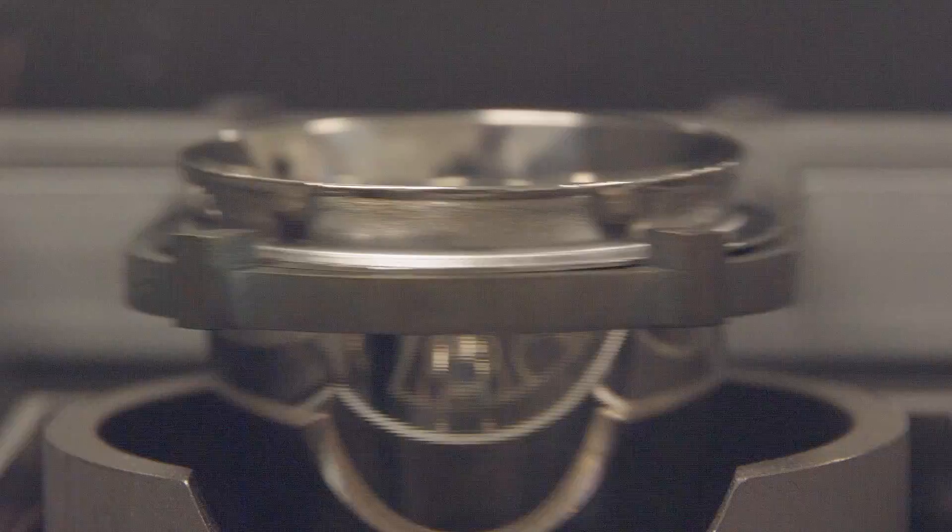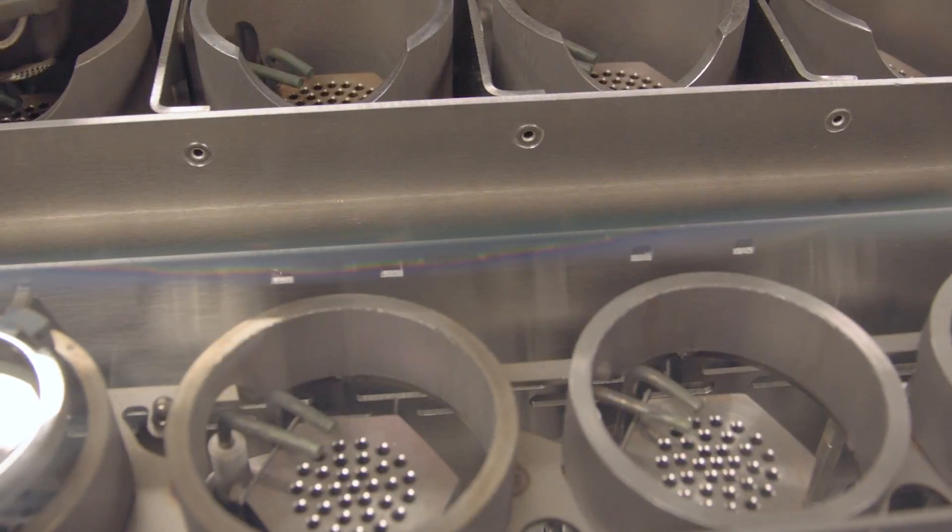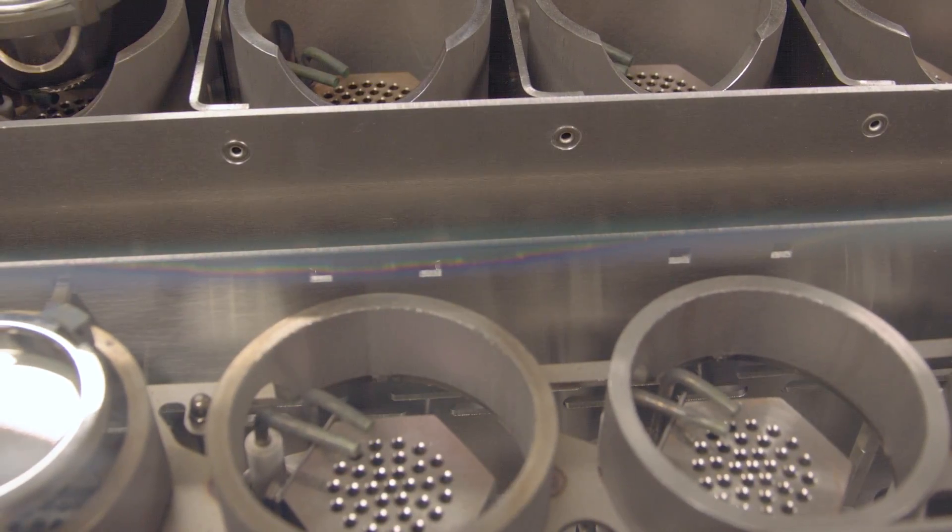Due to the nature of the industry, our range of lab equipment is engineered for precision and accuracy capabilities.